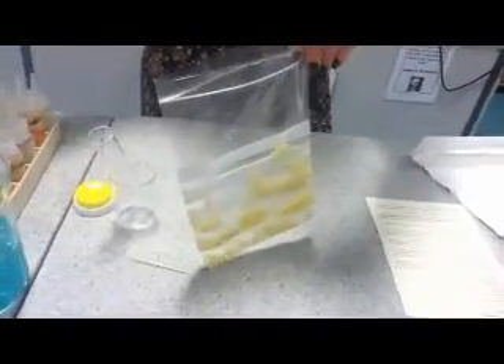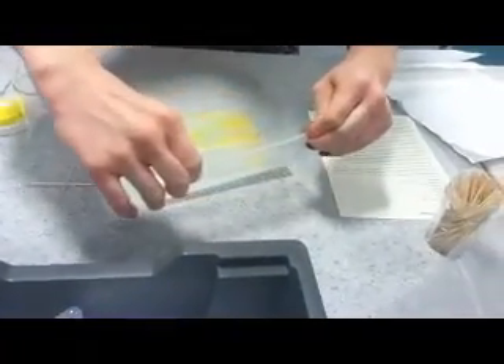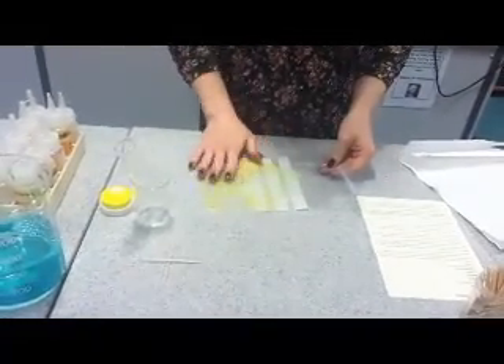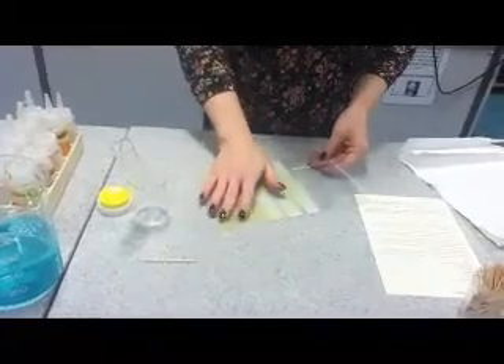You're going to add about 10 millilitres — these are one mil pipettes, so I want 10 squirts. Then try and get the air out again — you don't want air in because you don't really want bubbles. Seal it properly because we don't want banana mush squirting everywhere. Give it a little massage again and try to get all the fairy liquid around as many of those nuclei as you can.